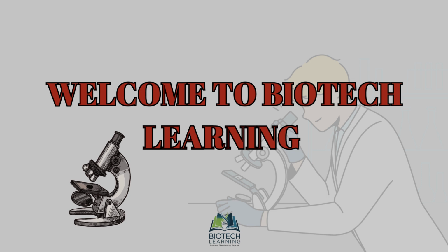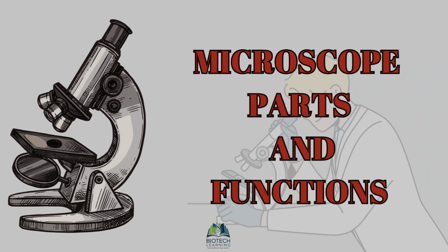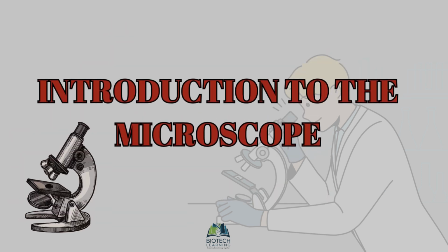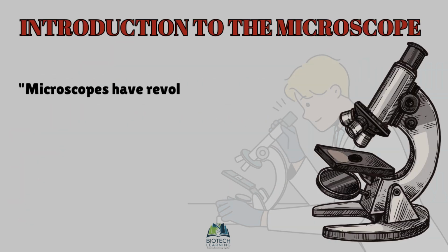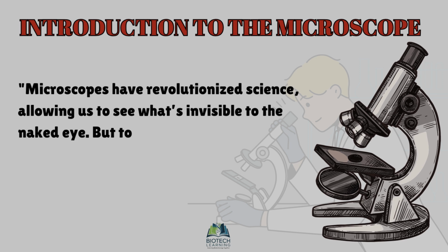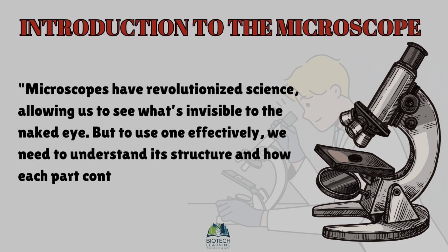Today, we're diving into one of the most essential tools in biology, the microscope. From its parts to its functions, we'll break down everything you need to know. Let's begin. Introduction to the microscope. Microscopes have revolutionized science, allowing us to see what's invisible to the naked eye. But to use one effectively, we need to understand its structure and how each part contributes to its functionality.